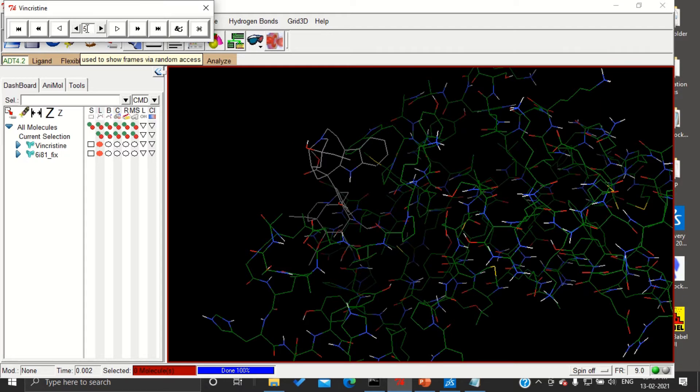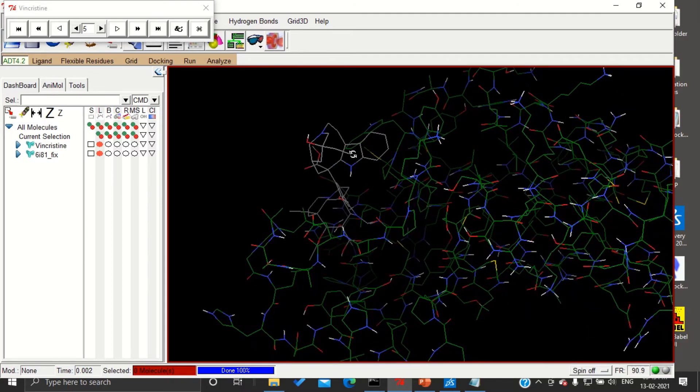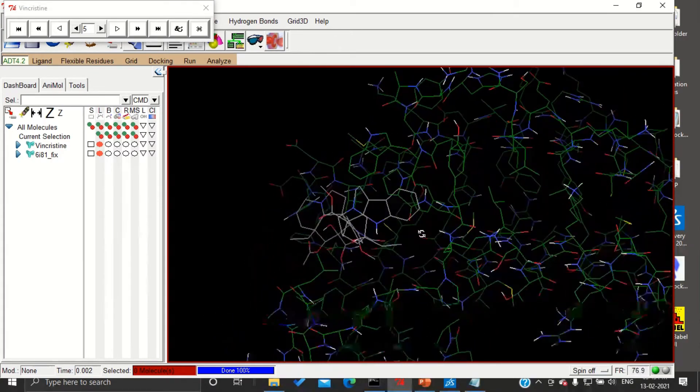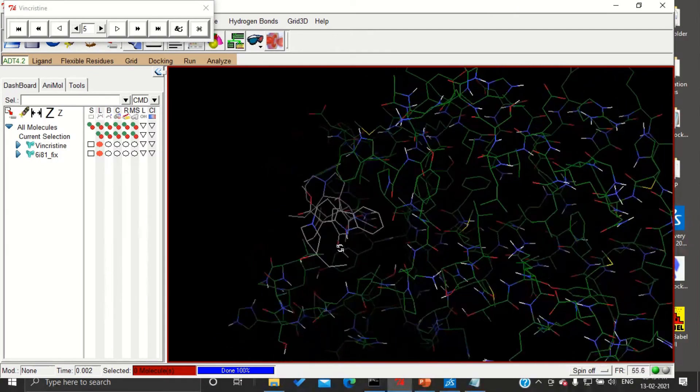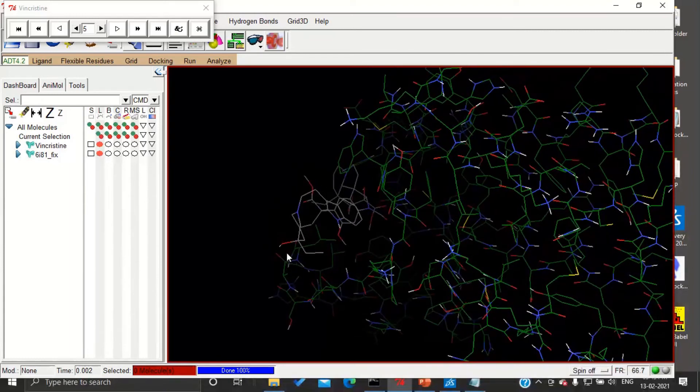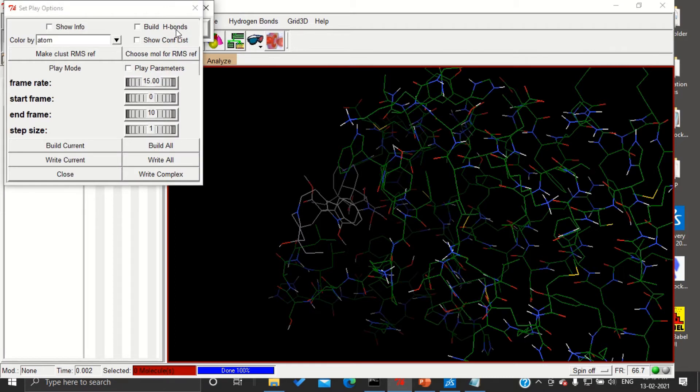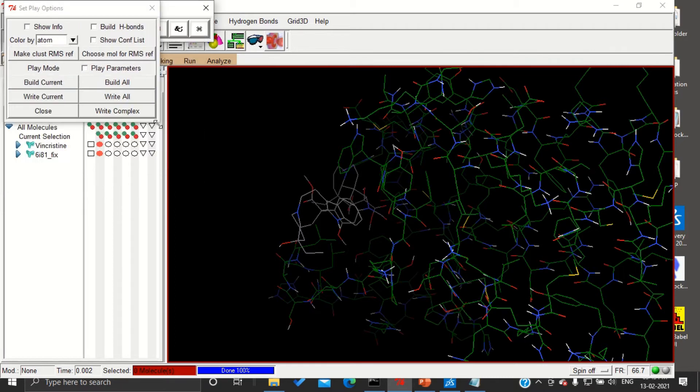Fifth conformation gave us very good binding, that is the least binding energy. So we are going to write the complex with this fifth conformation by pressing the end symbol, and then write complex.